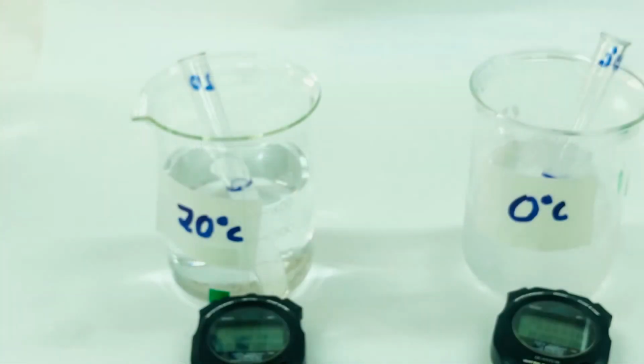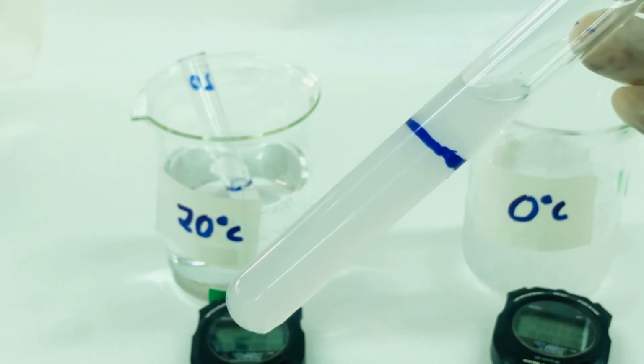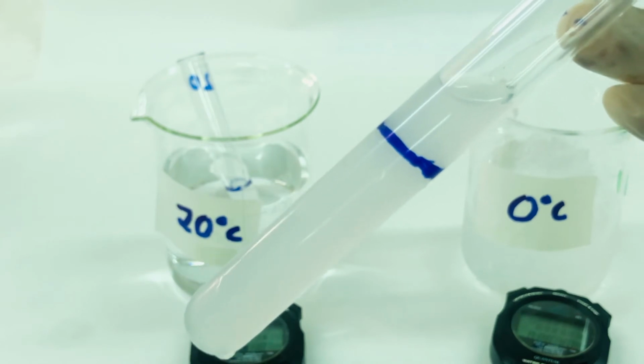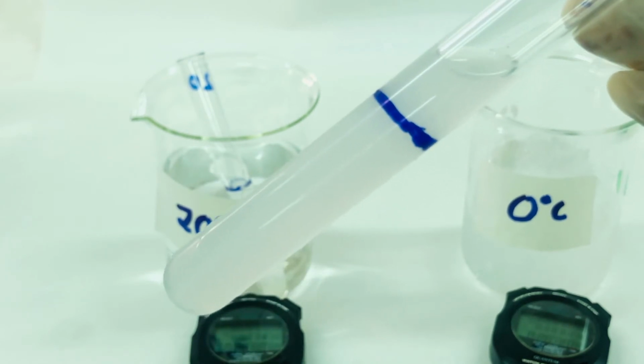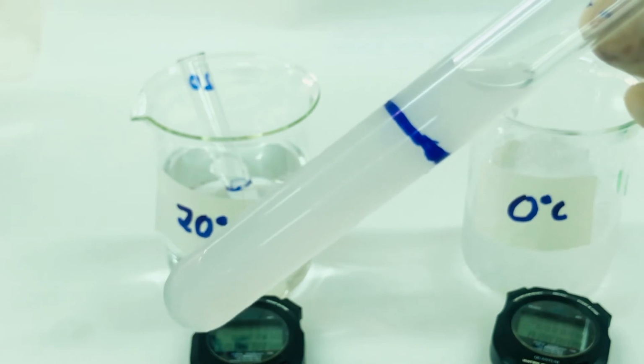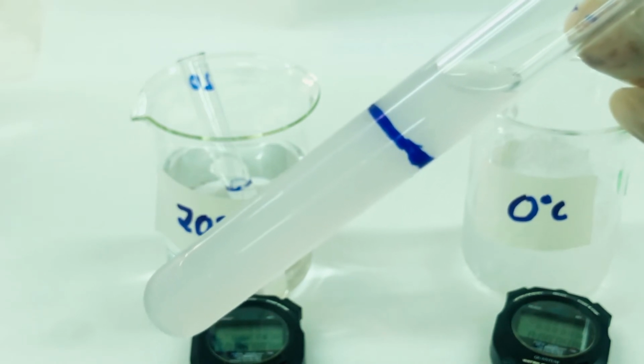Both for 0 degree and 20 degree C, we have not observed any major changes. This is 0 degree C sample, and you can see there is no curdling of milk that has taken place, no settling of the casein protein that has taken place.